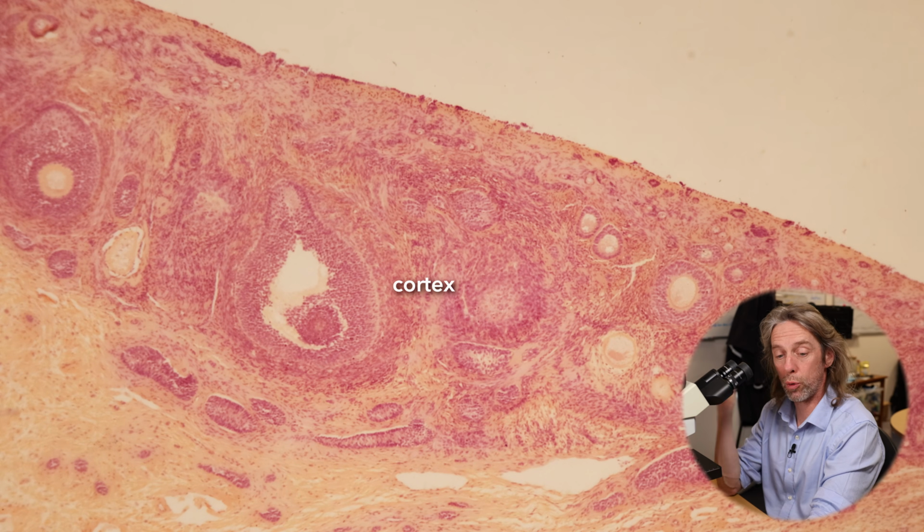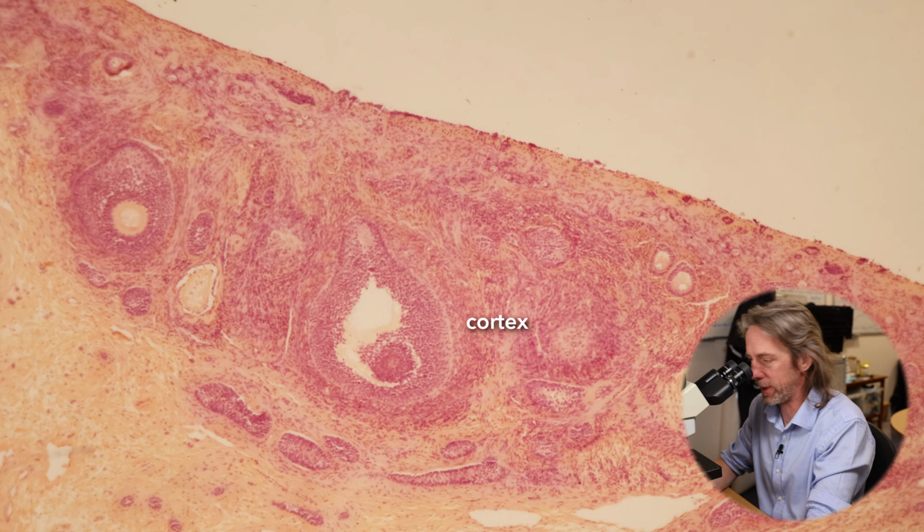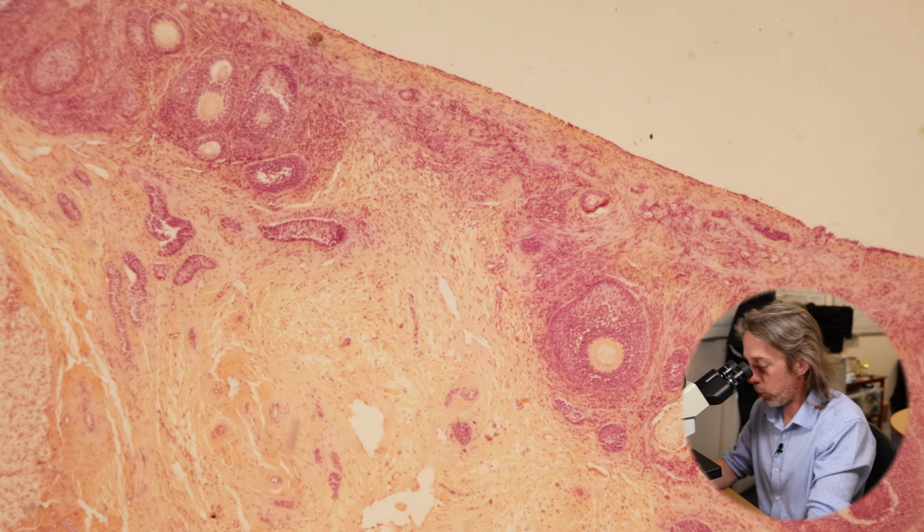So the ovary, like most organs, has a cortex and a medulla. The cortex is on the outside. That's what we're looking at there. We're up against the edge. If I zoom in, this is my 10 times objective.